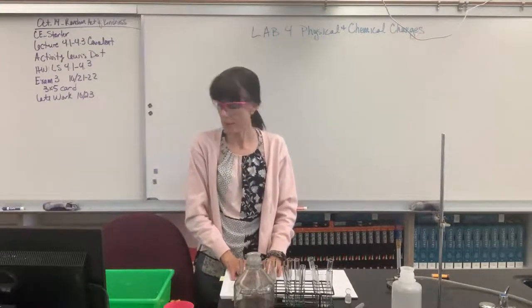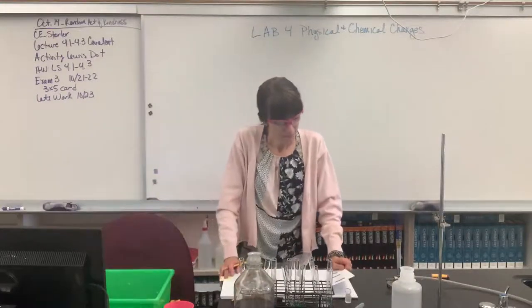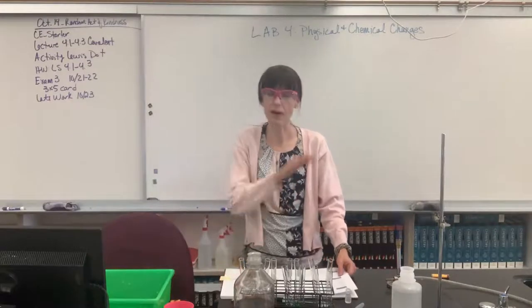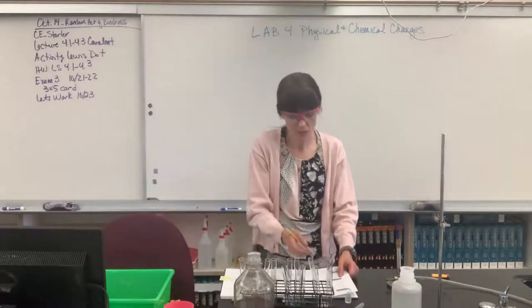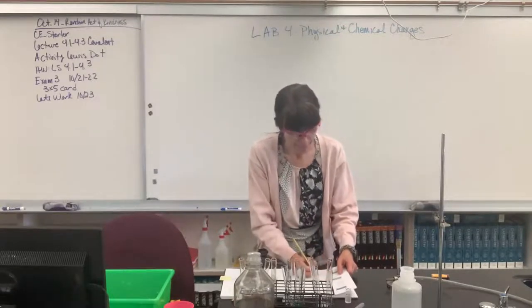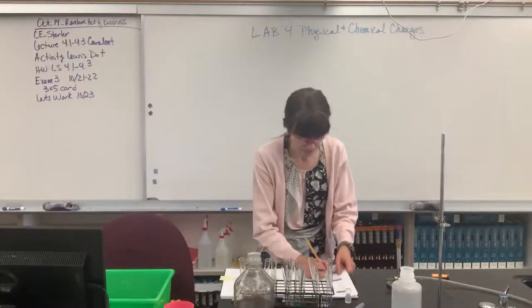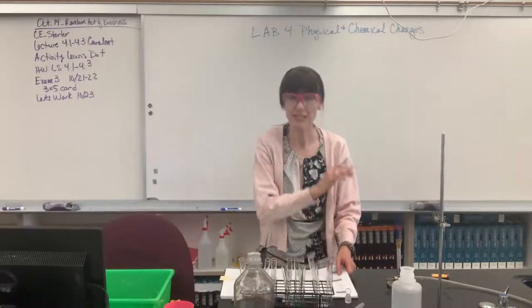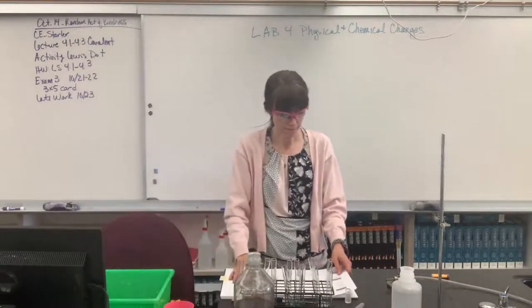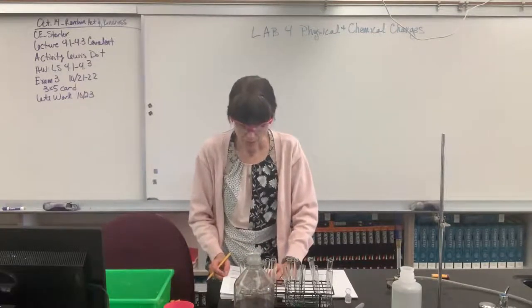Gotta see where I put my pencil. There it is. So let's go to page 54. I'm on part D. Color of the sample unreacted was white. It was a white powder. And then when it says result of adding calcium nitrate, it's clear. I couldn't see any reaction. There was no evidence of a reaction. It's still just clear. So let's now come back to step 4.